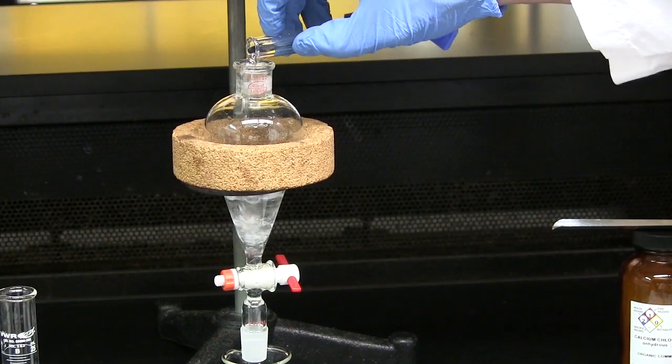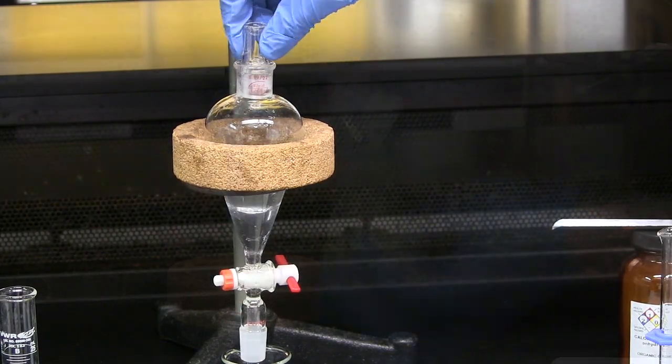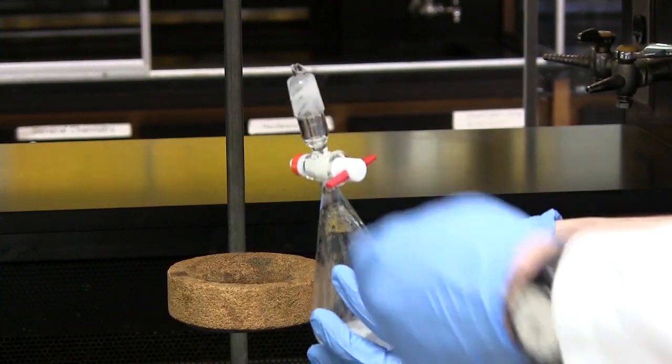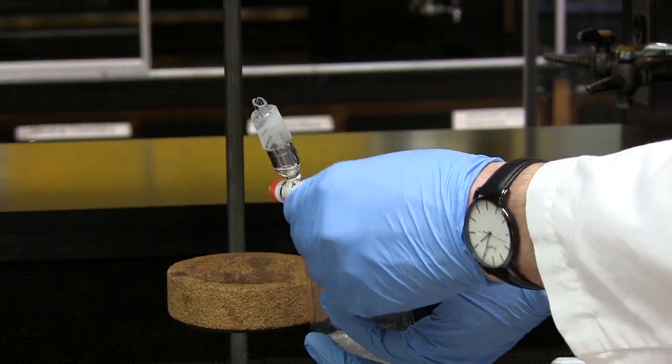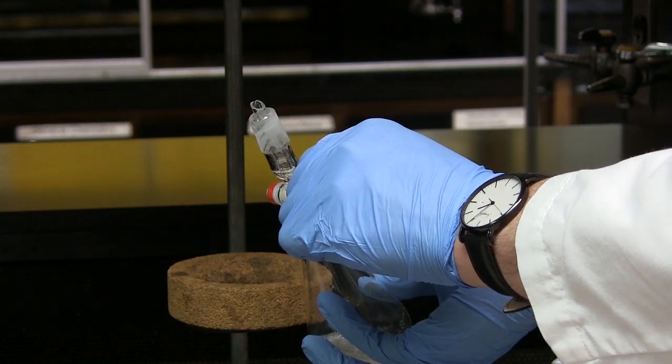Repeat the process with 10 ml of 5% sodium bicarbonate solution. Be sure to vent frequently to avoid pressure building up in the separatory funnel.